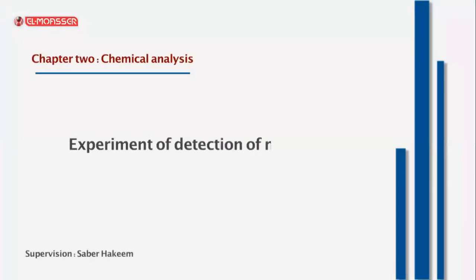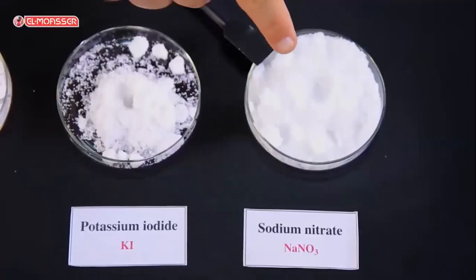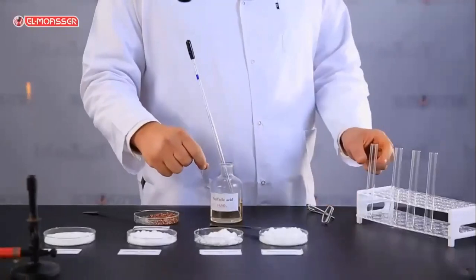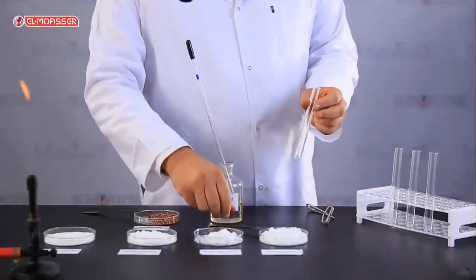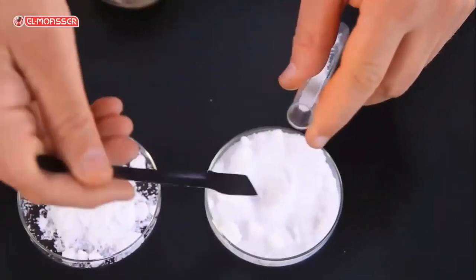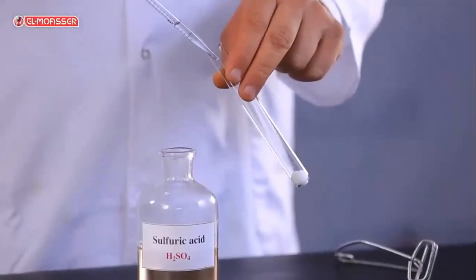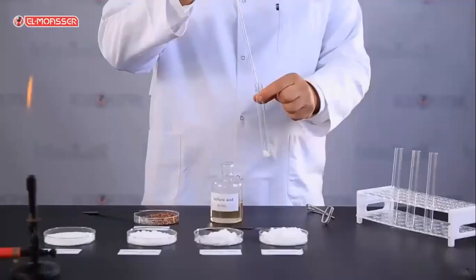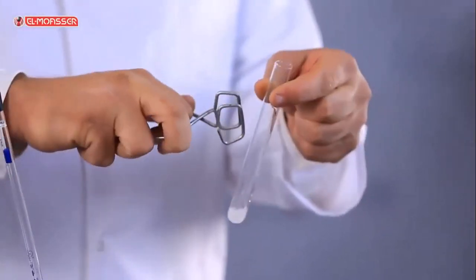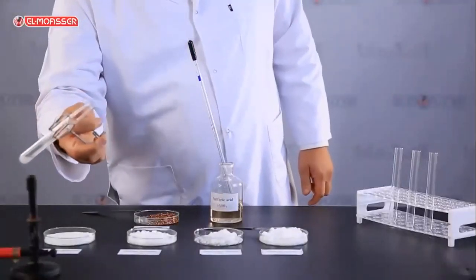Experiment of detection of nitrate anion. Nitrate anion is detected in sodium nitrate salt by a main experiment and another confirmatory experiment. Main experiment. Add to sodium nitrate salt drops of concentrated sulfuric acid and heat. What do you observe?